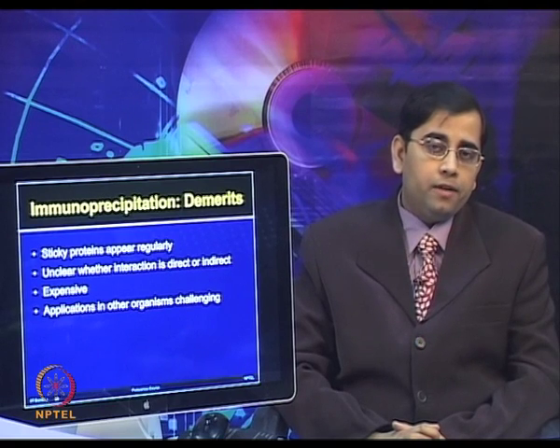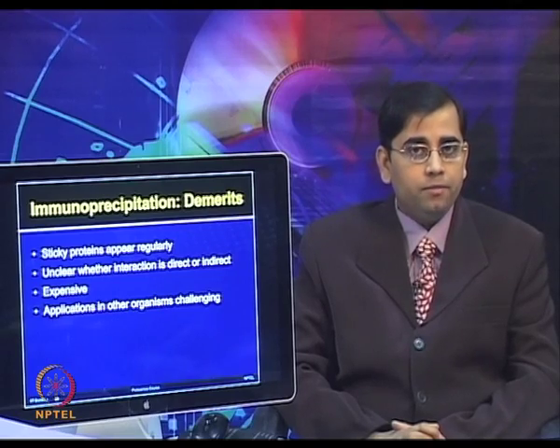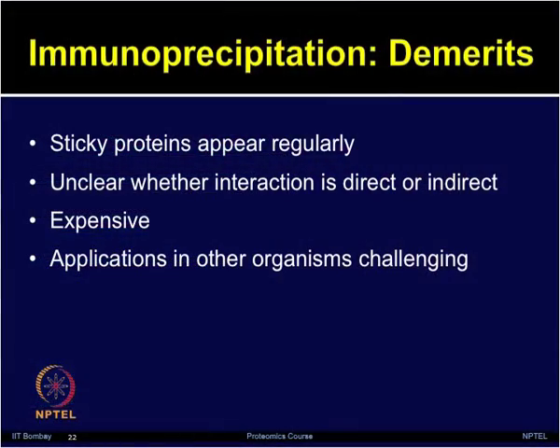It has been reported that sticky proteins frequently occur. Many proteins which may not be specific for that interaction could also be eluted just because they are sticky on the other protein surface. So, these proteins could also provide us non-specific results.